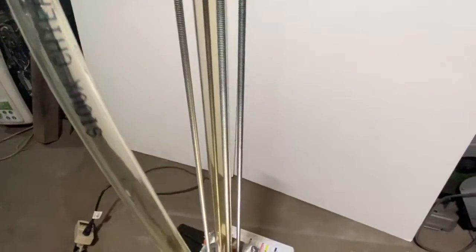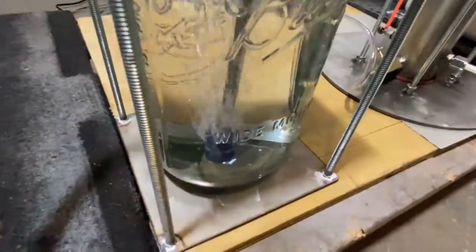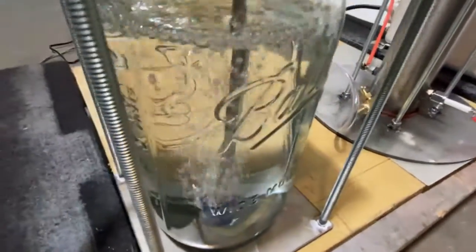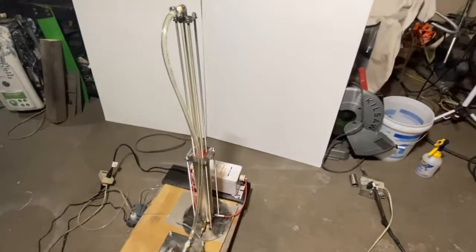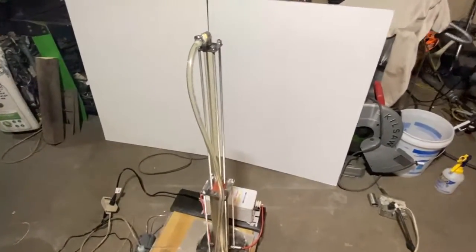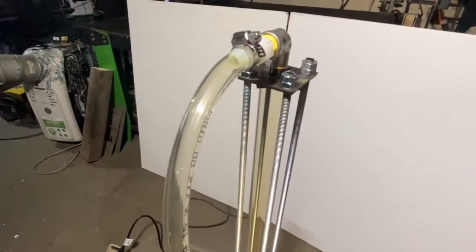We're about six hours in, at a fairly high flow rate, but we still have enough nitrogen dioxide to work with. I'm going to be building the other bubbler soon — we're going to do the dual bubbler action. You can see the brown gas is present.